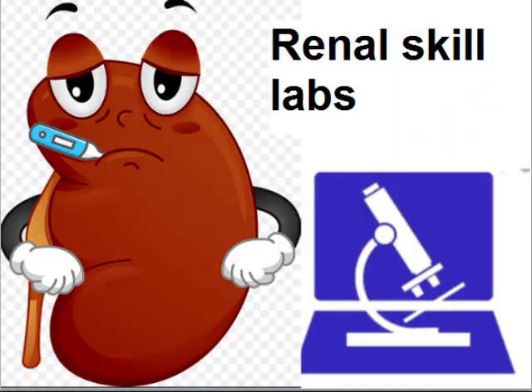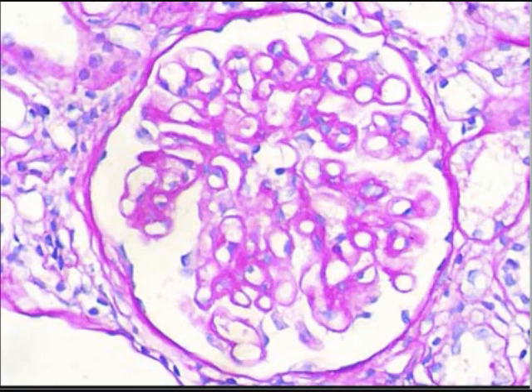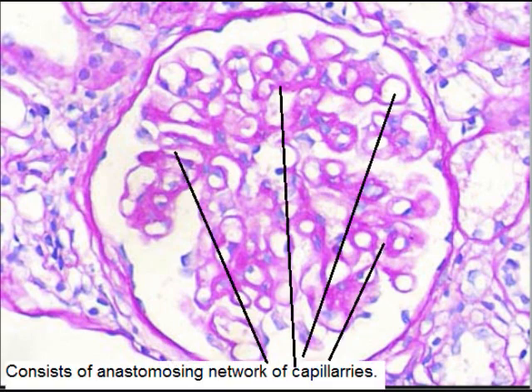Now we are doing renal skill labs — the kidney diseases which can be seen under the microscope. First of all, we should try to understand what is the structure of the glomerulus, because the glomerulus is the main structure. It is composed of tufts of capillaries, an anastomosing network of capillaries, as you can see in this photograph.